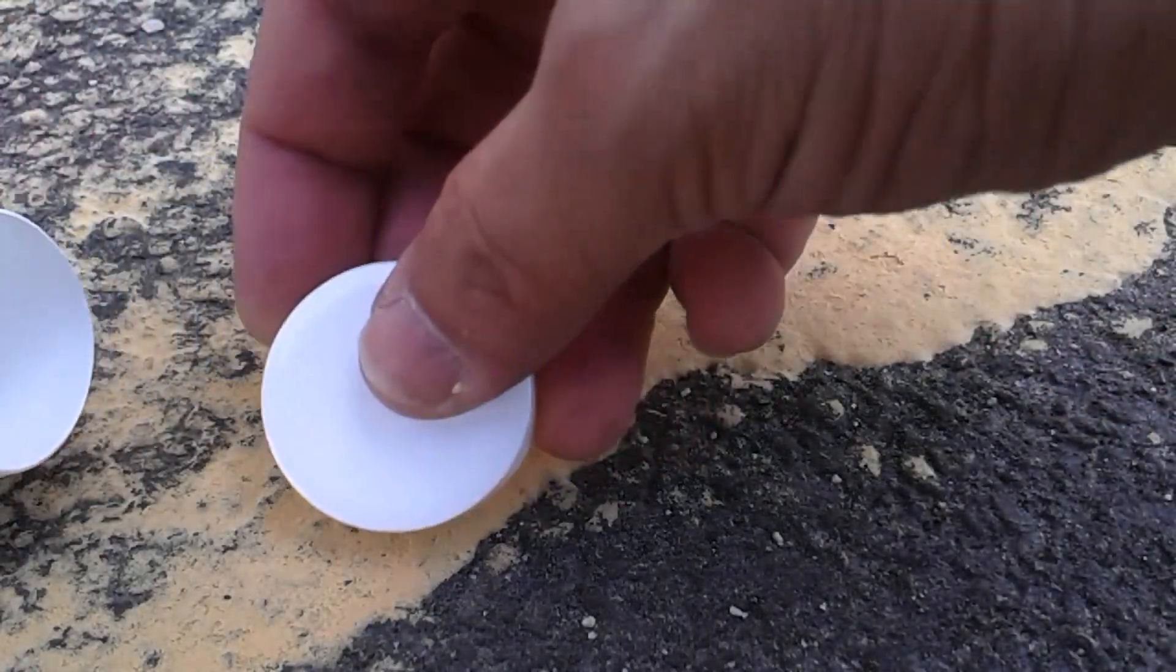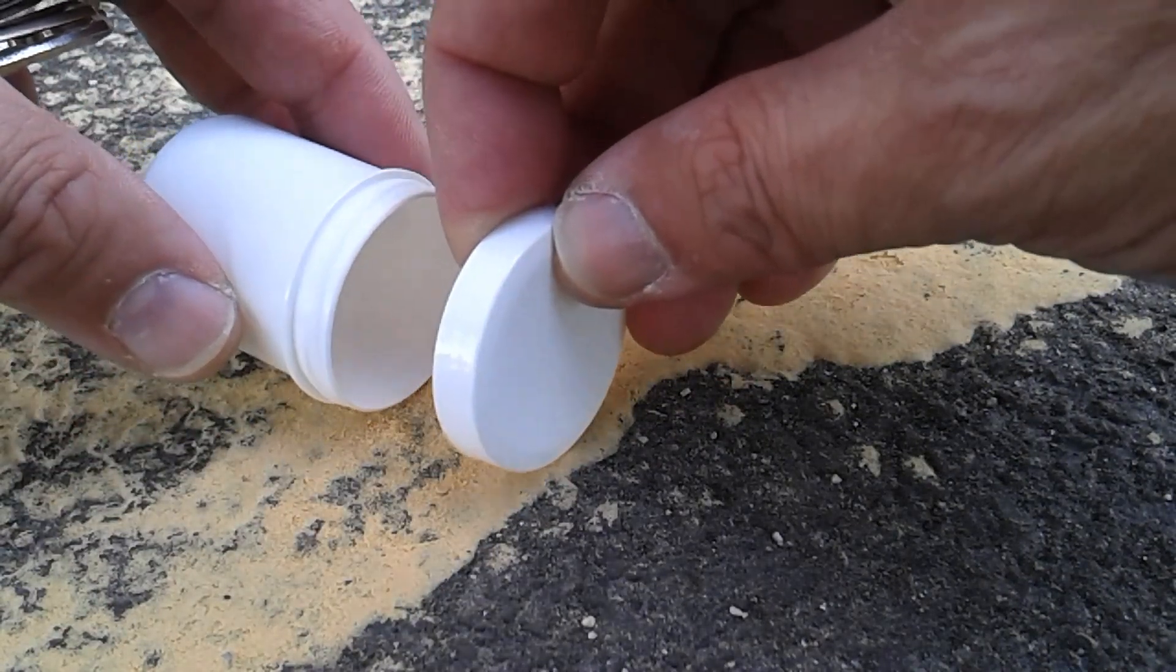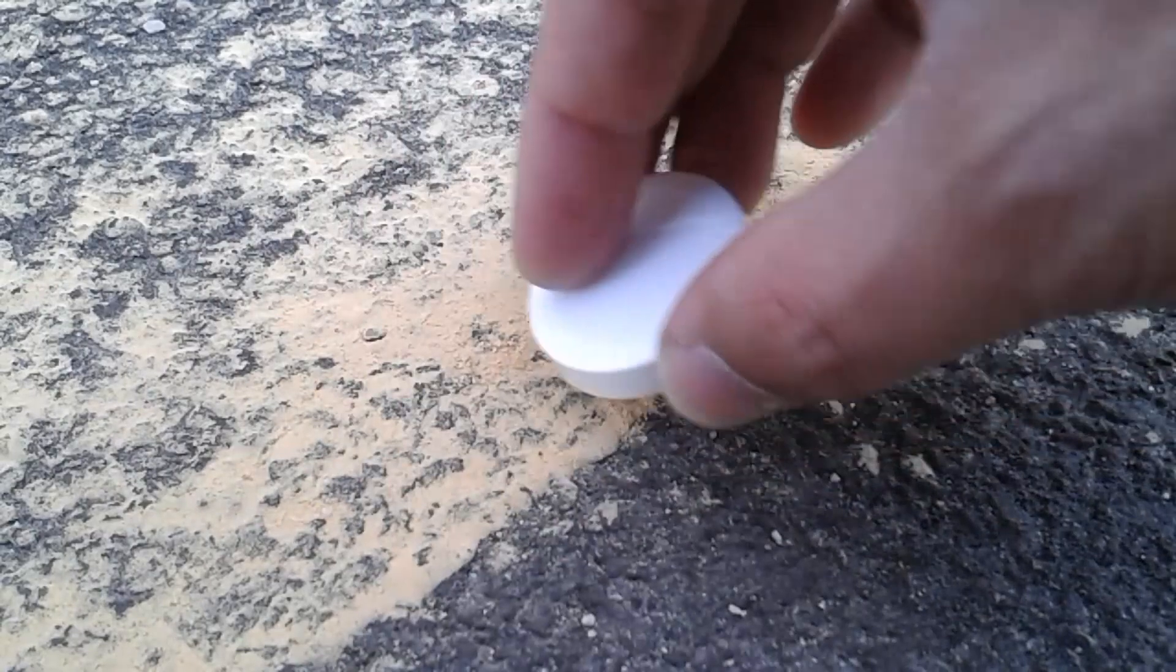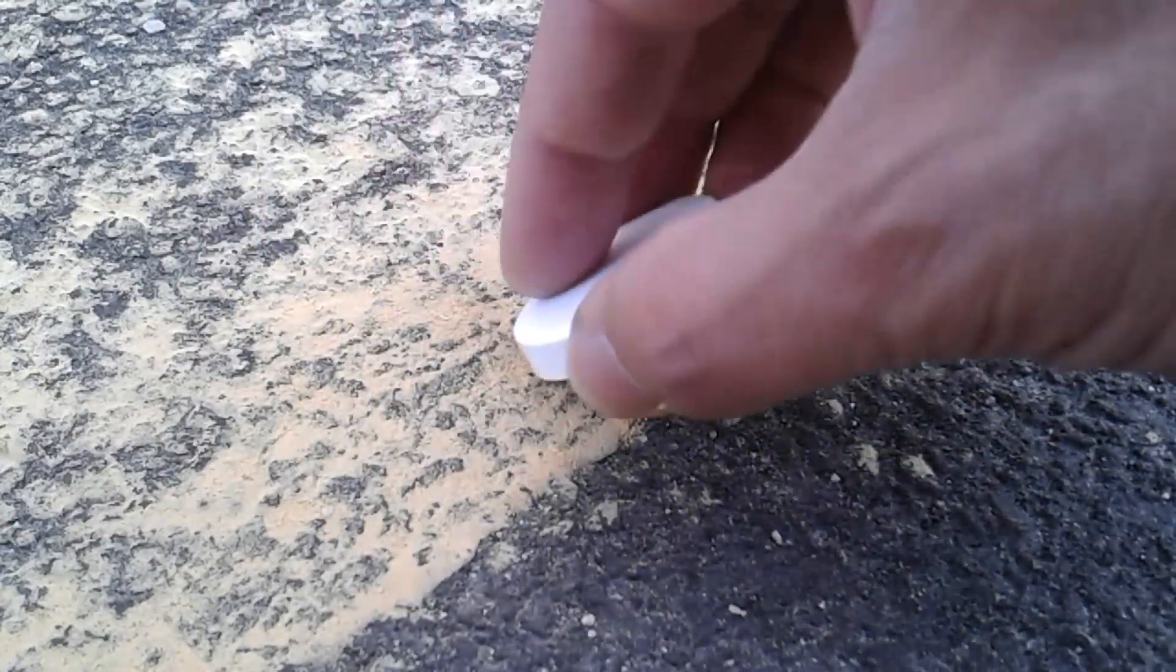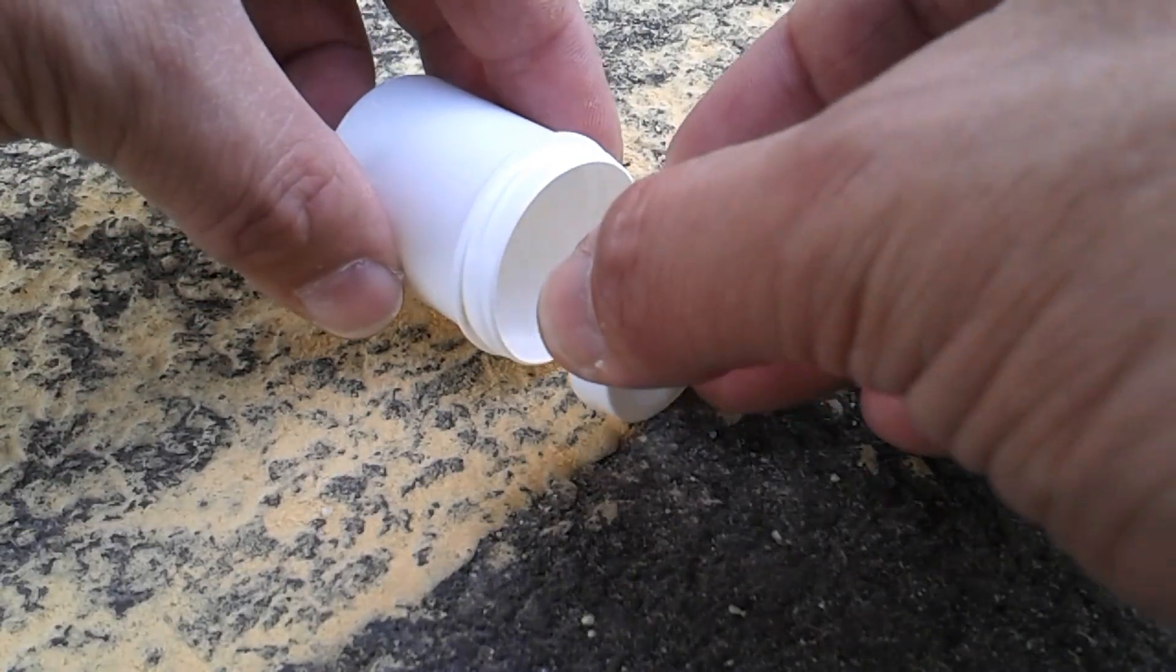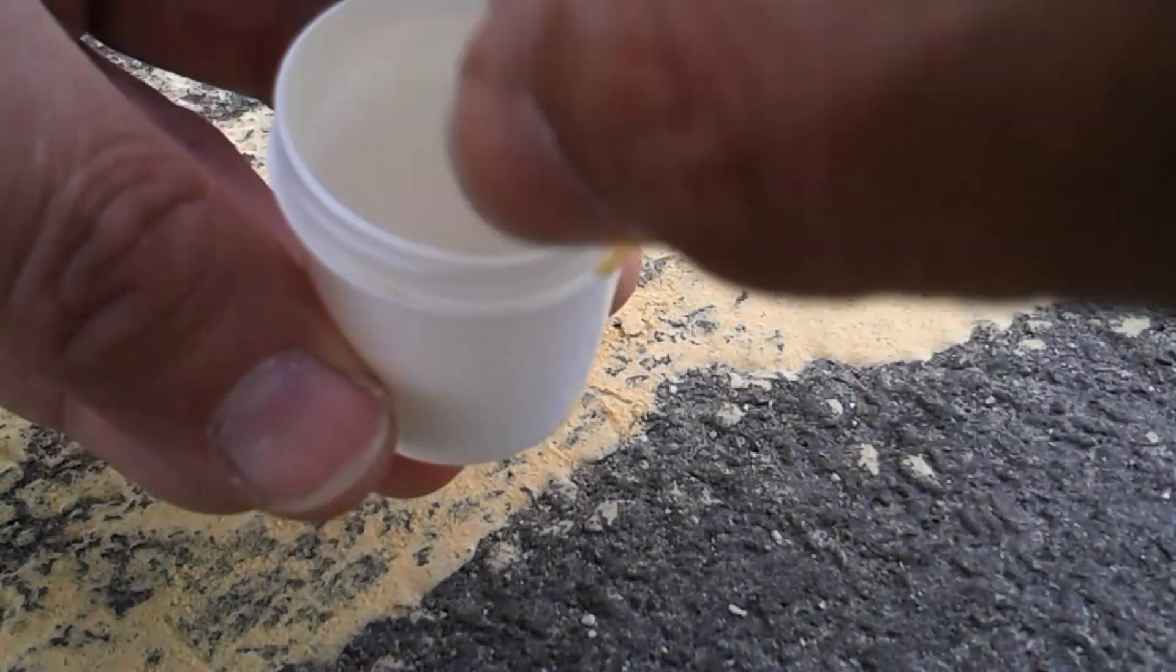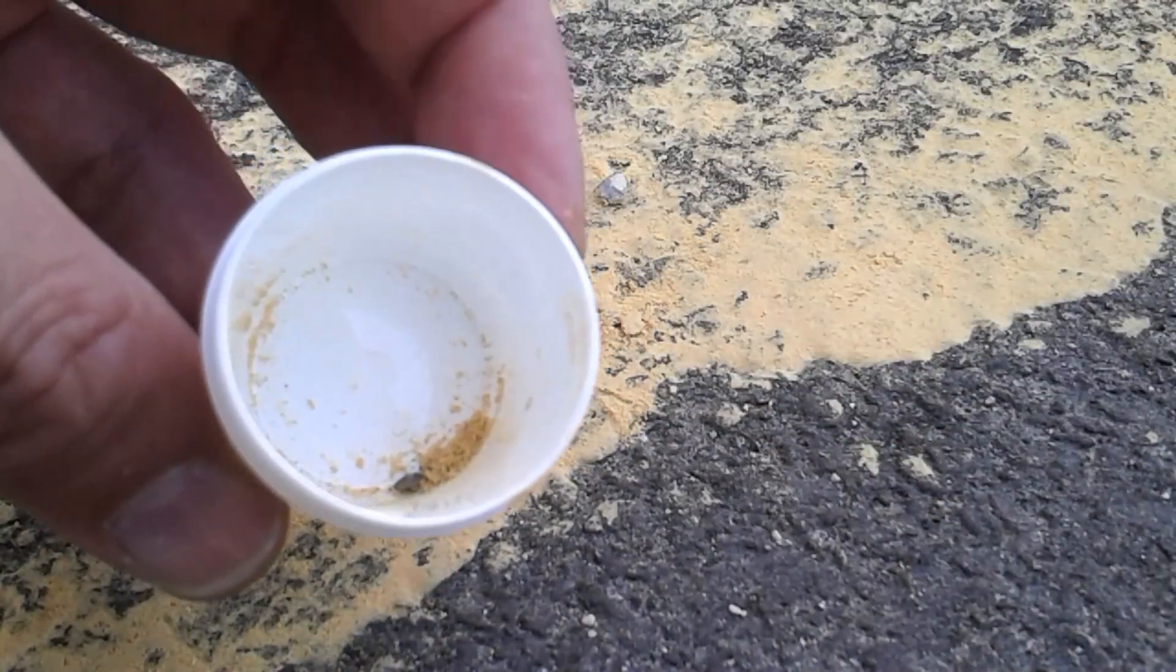Unfortunately I forgot my tools at home so I have to scratch off some material just like this. The pollen were difficult to separate from the ground because they were sticking together. When the rainwater evaporated, it caused the pollen to stick together, so some material from the ground was also collected, but that's okay.